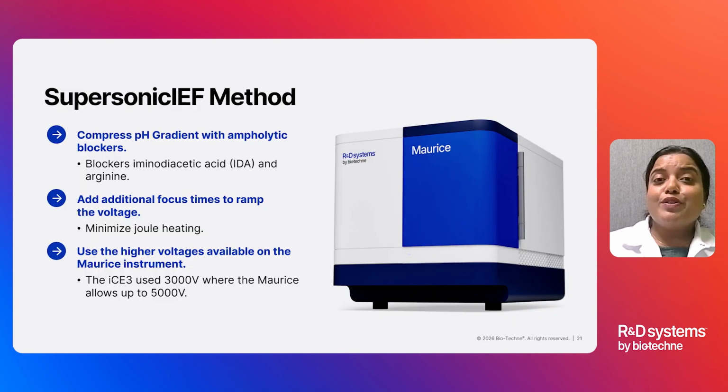To summarize, the supersonic icIEF method is a rapid icIEF method that achieves faster separation through 3 key innovations. First, ampholytic blockers such as IDA and arginine compress the pH gradient, reducing the distance protein needs to travel. Second, additional focus steps allow the voltage to be ramped while minimizing Joule heating. And finally, Maurice can operate up to 5,000 volts compared to 3,000 volts on earlier systems, further accelerating protein focusing. Together, these improvements reduce analysis time while maintaining the high resolution and reproducibility required for charge variant analysis.